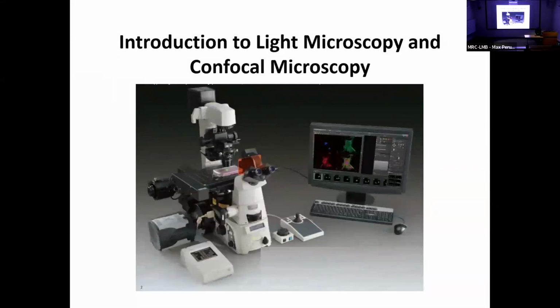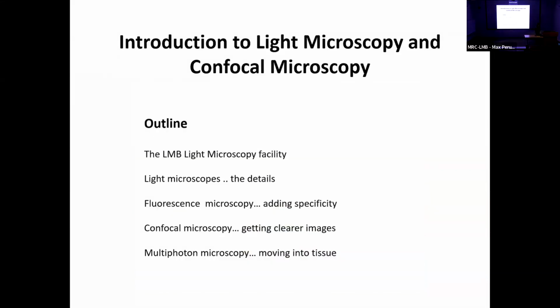Okay, so I'm going to talk about light microscopy and confocal microscopy. But first, I will give a brief overview of what we actually do here, the people who do it and what there is, and then we'll get into the microscopy itself.